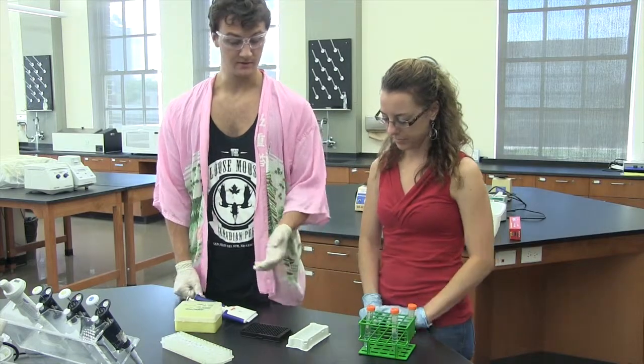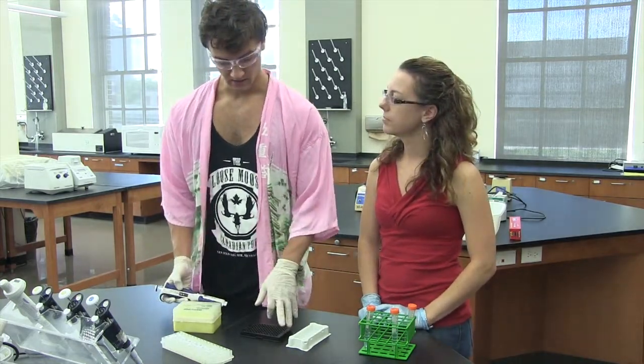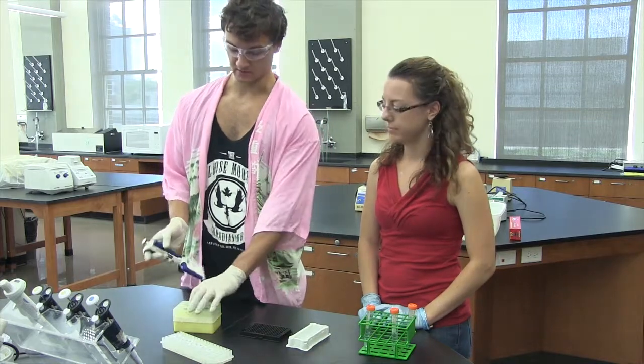A and B are generally just going to be a blank buffer. C through E, how I'm going to be setting it out today, is going to be our wild type protein. And then F through H is going to be our respective mutant.